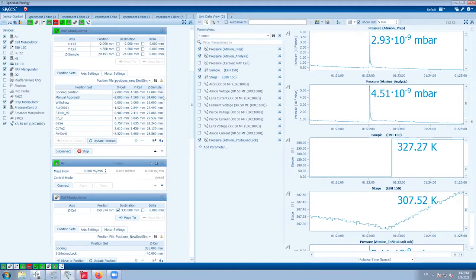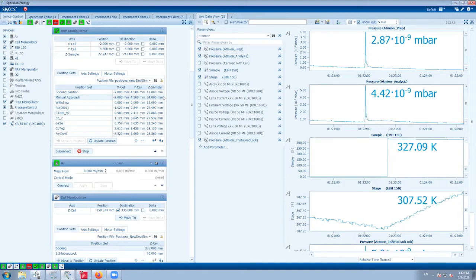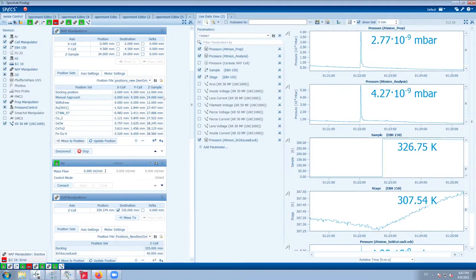If you have a very thick sample, somebody may want to measure a sample which has like 1 centimeter thickness or so. The sample then can break the nozzle, and the nozzle is quite difficult to replace. It is expensive, so it is quite a headache if you damage the nozzle. And it is very sensitive.